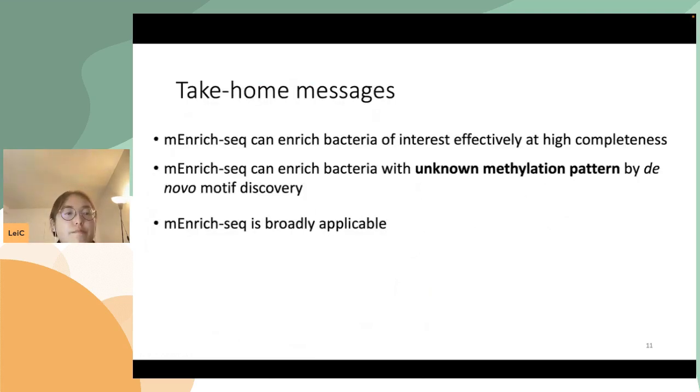So the last slide will be the take-home messages. Here we demonstrate our new method, mEnrich-seq, which can effectively enrich bacteria of interest at very high completeness of their genomes. And we can also enrich some bacteria with unknown methylation patterns by a de novo motif discovery approach. And most importantly, mEnrich-seq is broadly applicable.